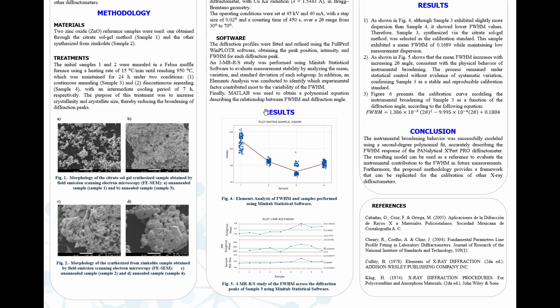Once the sample was selected, an individual moving range and range analysis was performed to evaluate the behavior and variability of its measurements. After completing all the analyses, we determined that sample 3 was the most suitable and best met our conditions for use as a calibration standard.